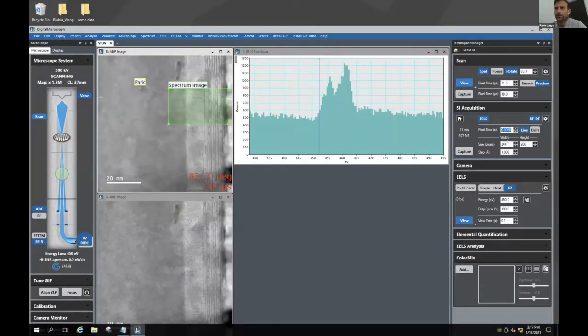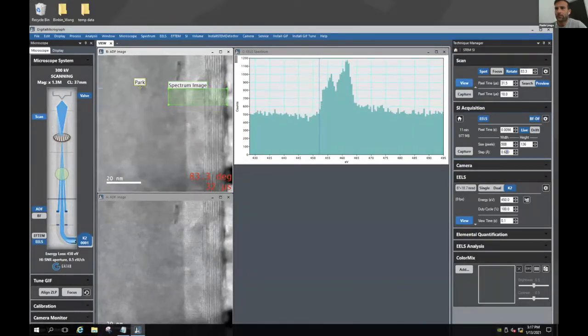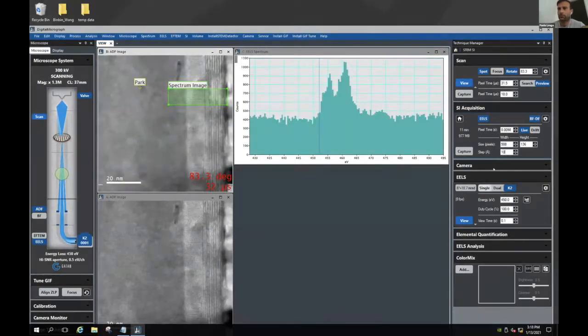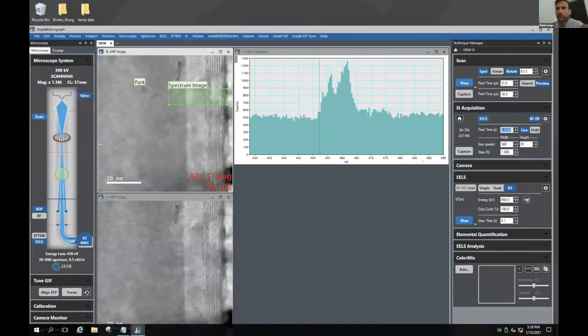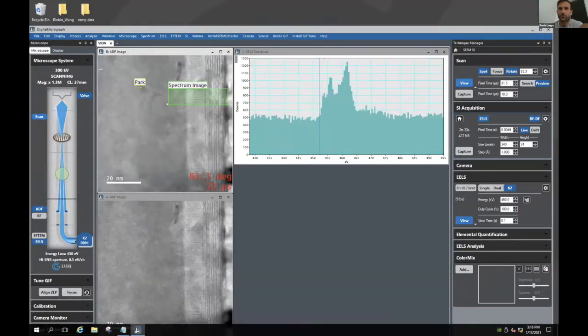So now 11 minutes, but maybe you can make it a little bit smaller. Something like this, maybe. And then maybe you choose 1 angstrom resolution. Then perhaps let's use 5 millisecond exposure time. So we'll take 2 minutes and 33 seconds to cover the whole thing. I'm gonna make it smaller, I don't wanna wait that long.